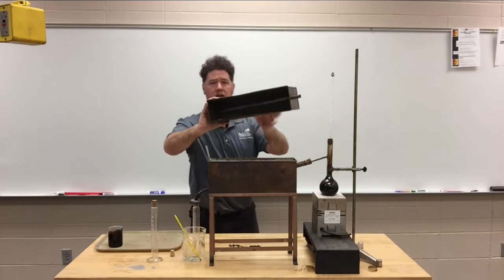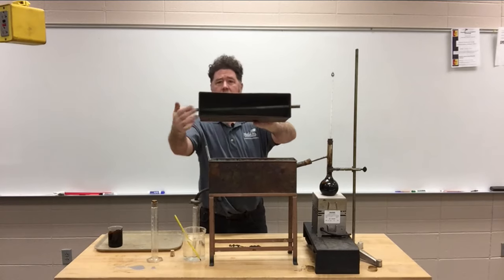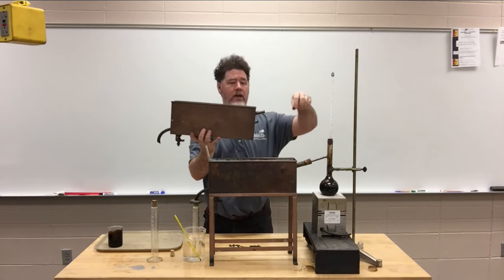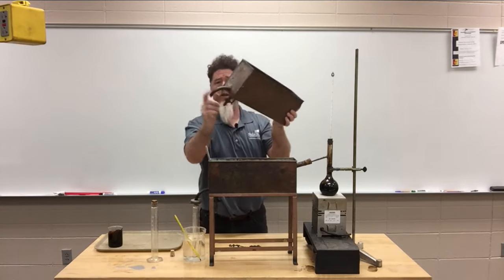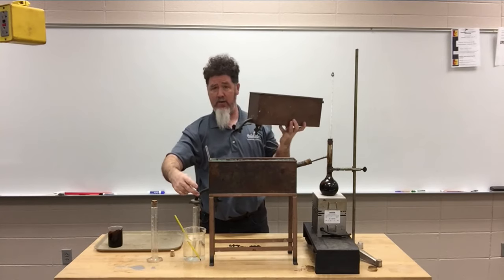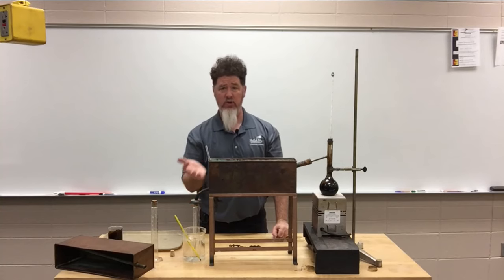So you can see what all it is that you got yourself. Over here, you got yourself a tube, and the tube goes all the way from one end, and it comes out of the other side over here. So you have a tube that is in a big box that's full of water and ice, is all it is. As the vapors are going through the tube, the tube is angled down from the top to the bottom. It's gonna flow downhill. The fuel vapors are gonna condense, and as they condense, they're gonna come out of this tube right here. And so this tube right here is where I'm gonna capture my fuels that are coming out.